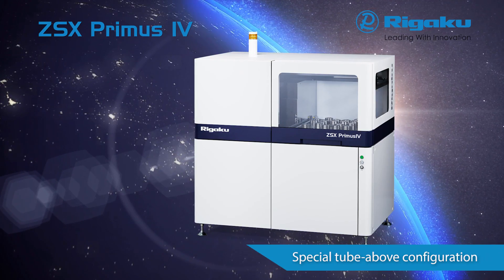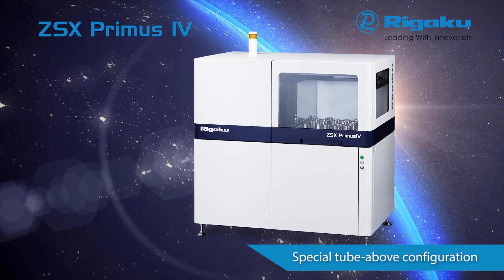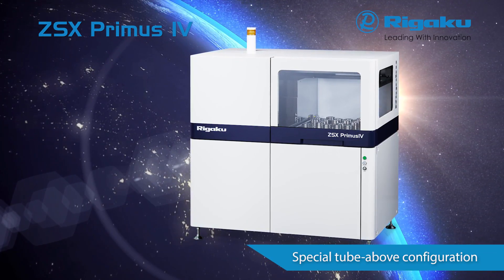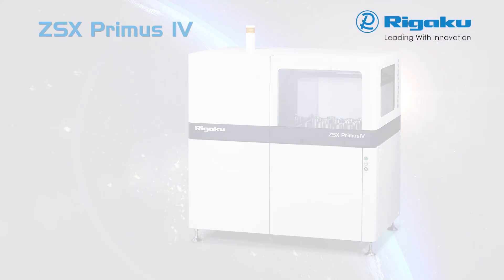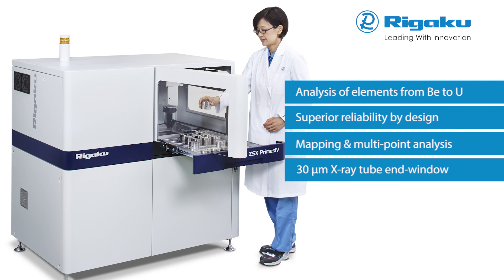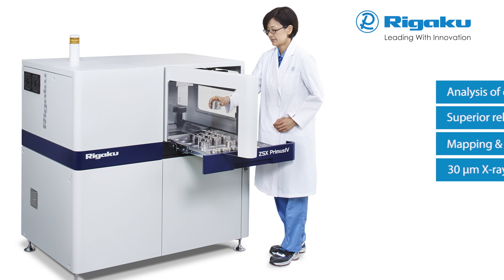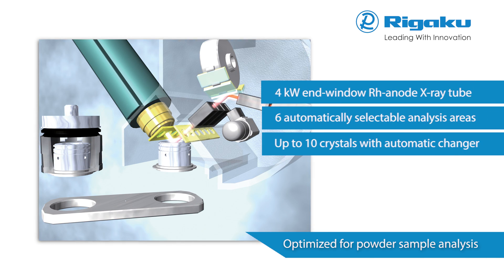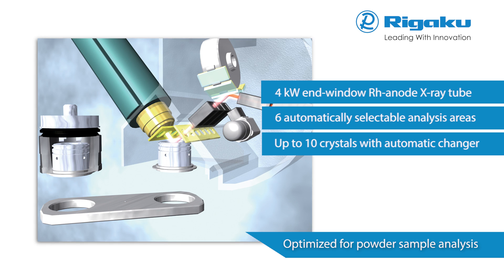The premier instrument in the ZSX series, the ZSX Primus IV, continues the tradition of tube above inverted optics for enhanced reliability and durability. While this configuration offers superior performance for all applications and sample types, the tube above design is strongly recommended for powder applications. With the tube above design, accidental contamination of the goniometer or inadvertent damage to the X-ray tube is minimized.